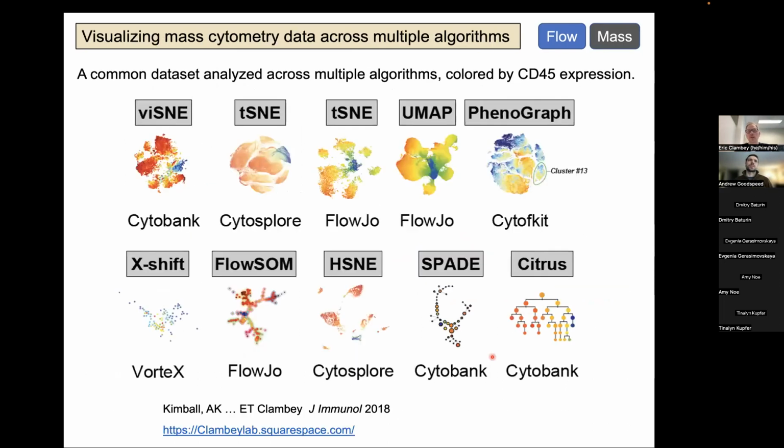And for instance, this is already an out-of-date example, but there are numerous different algorithms identified with the gray boxes. And interestingly, the data shown here is the exact same data set, okay? And so this simply exemplifies that different algorithms are visualizing the data differently. And you need to be conscious of what the different visualizations depict. And if you are interested in some examples of this, I would strongly encourage you to look at this paper that Abby Kimball and my group previously published, which walks you through some of the data visualization and considerations for these algorithms.